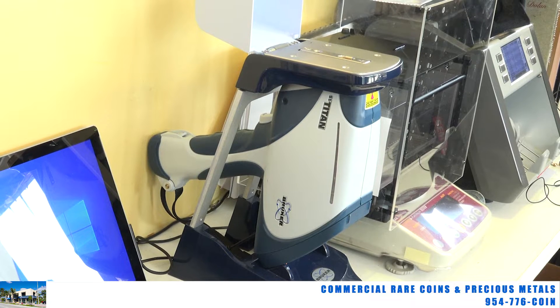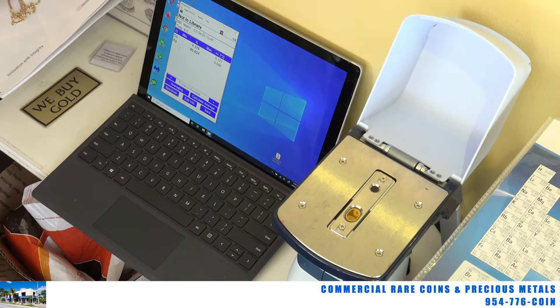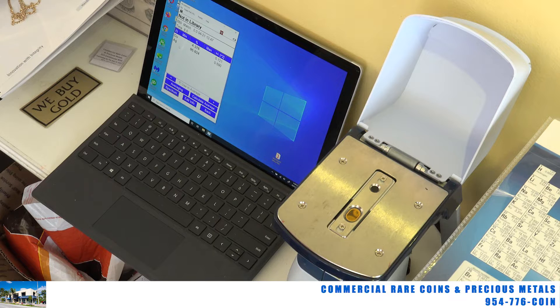What this machine basically does — it's often mistaken for an x-ray machine, but it is not an x-ray machine. It does not x-ray and tell you what's in the center of the item, which most of us think of when we hear 'x-ray machine.' It's not really called an x-ray machine; it's called an XRF machine, which stands for X-ray fluorescence. You can look it up online — Google 'XRF' and you'll find out more than you need to know.